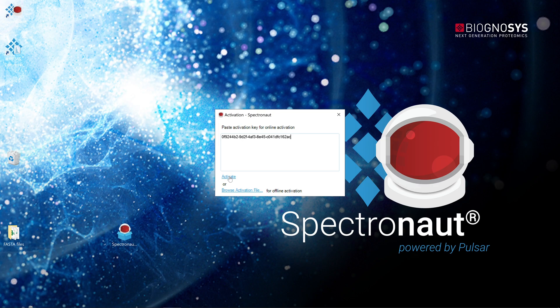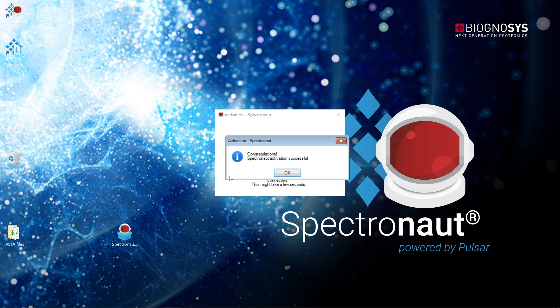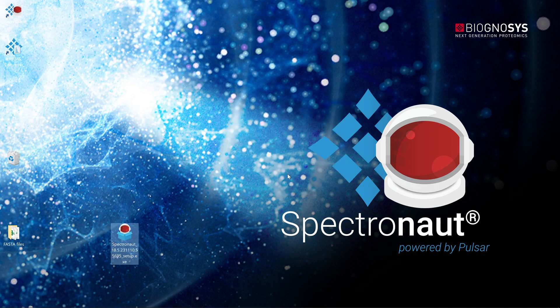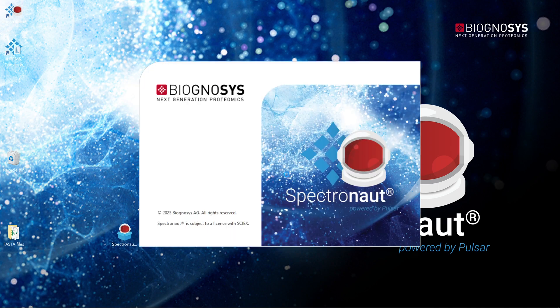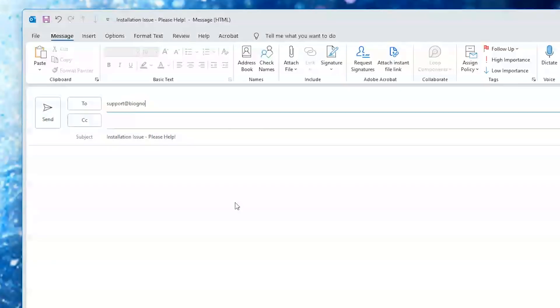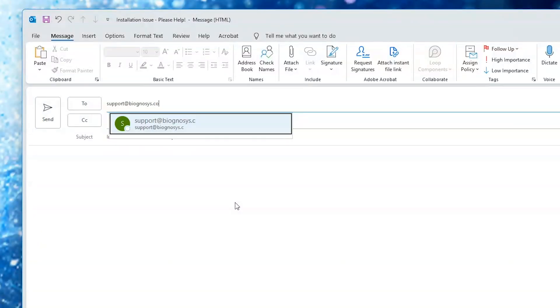If the software can't reach our servers, an offline activation process will be initiated. Follow the steps displayed in the software activation window. In case of any doubts, you can always reach out to us at support at biognosis.com.